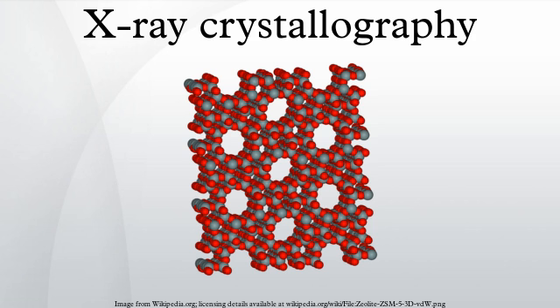The intensity of each diffraction spot is recorded, and this intensity is proportional to the square of the structure factor amplitude. The structure factor is a complex number containing information relating to both the amplitude and phase of a wave. In order to obtain an interpretable electron density map, both amplitude and phase must be known. The phase cannot be directly recorded during a diffraction experiment. This is known as the phase problem.